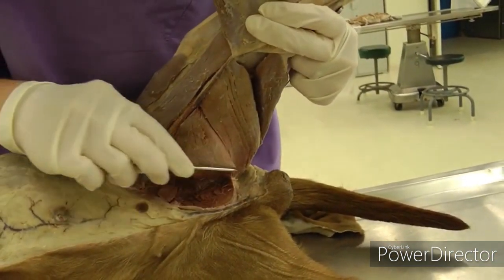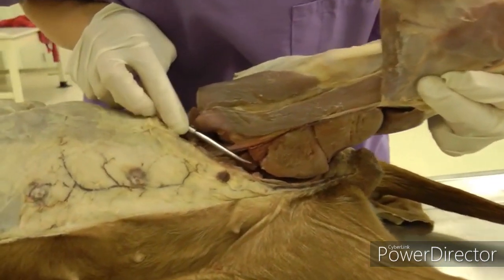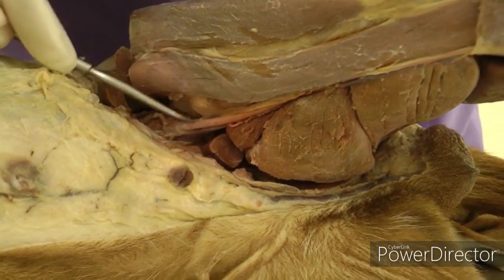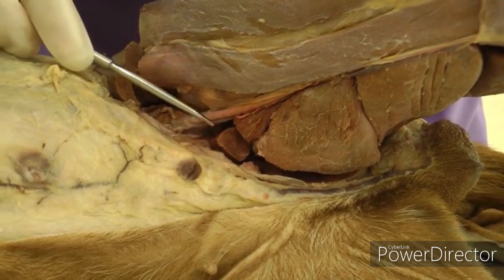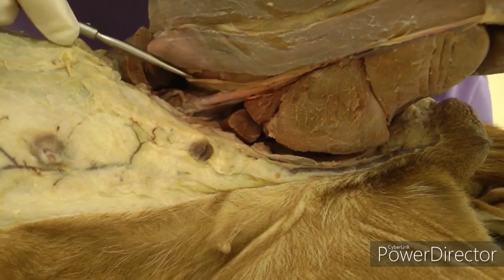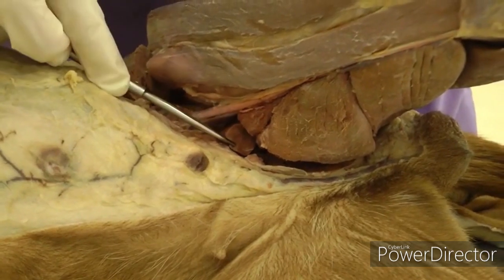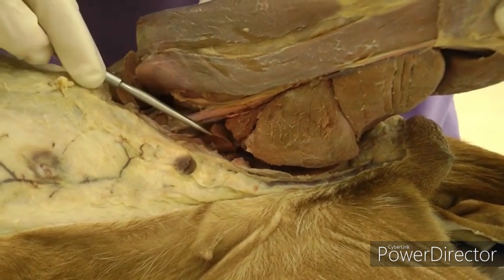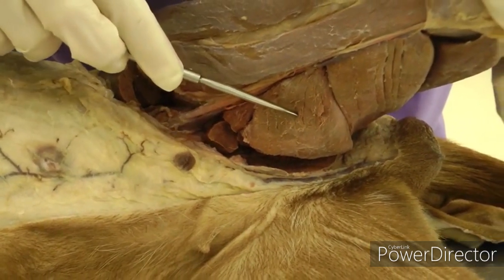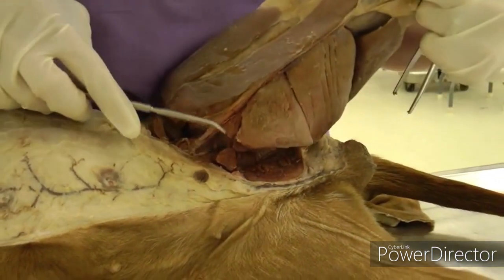Under gracilis you will see the adductor muscle — the really big piece — and then pectineus, which is a little spindle shape just cranial to the adductor. Just cranial to pectineus is the femoral triangle, where you'll see the femoral vessels coming out. Pectineus has been cut here — you will also do that. Note that pectineus tends to rip, so you may want to cut it sooner rather than later. The adductor has two parts, but you don't need to differentiate them in the dog.